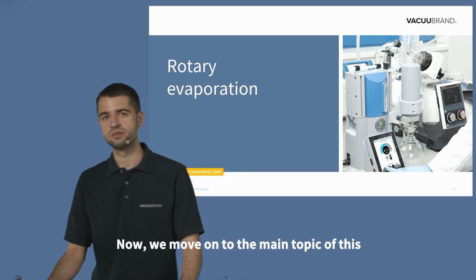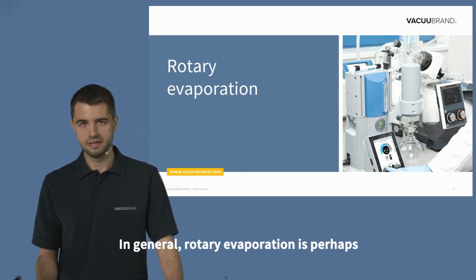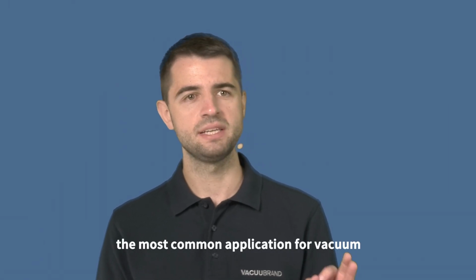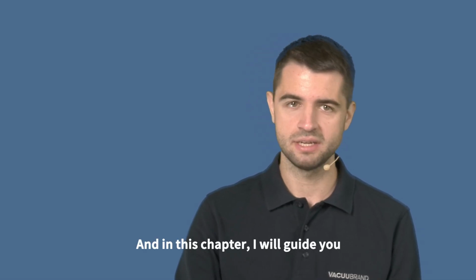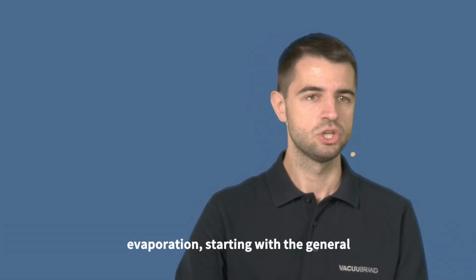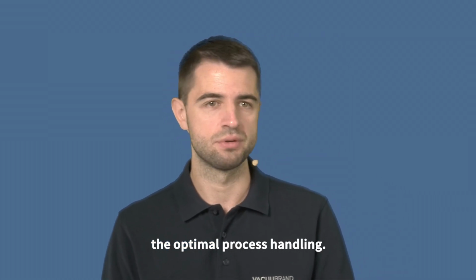Now we move on to the main topic of this webinar, the rotary evaporator. In general, rotary evaporation is perhaps the most common application for vacuum technology in the lab. And in this chapter, I will guide you through the entire process of vacuum evaporation, starting with the general setup and then ending with the optimal process handling.